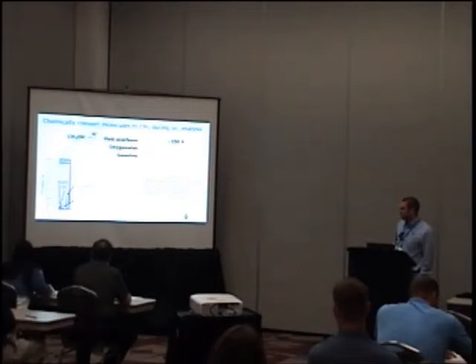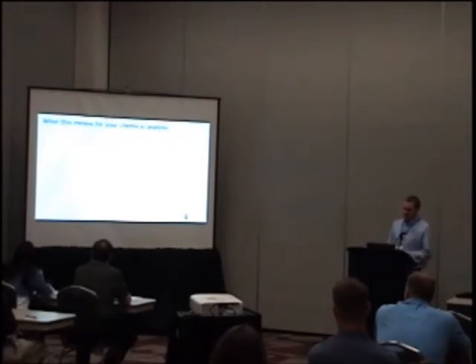And this was actually very important for Michel Sarazin's research in elucidating the mechanisms for this MTG chemistry and the fundamental bond-making chemistries, the CC bond chemistries, that happen on these solid acid catalysts. So you may be asking, this is great, how can it help me with my analysis, and where is the proof that the quantification is actually accurate?